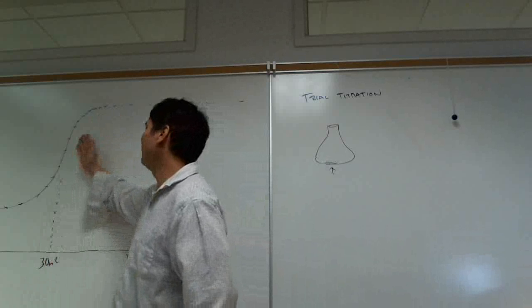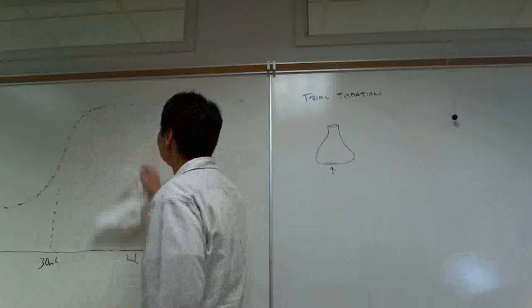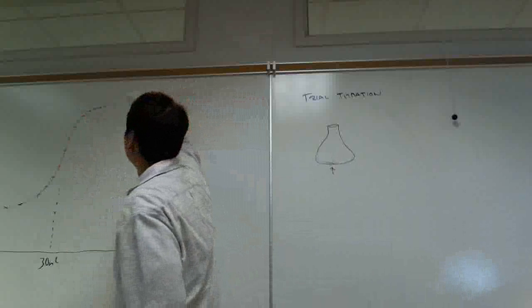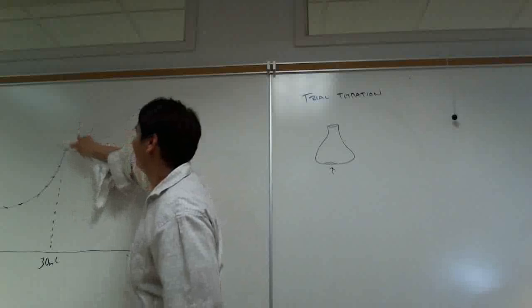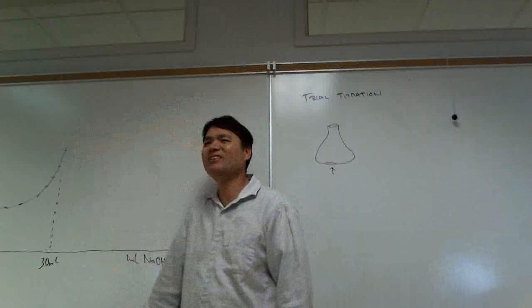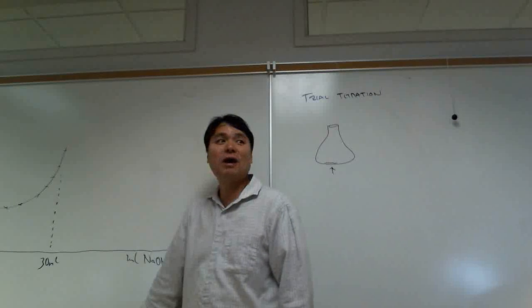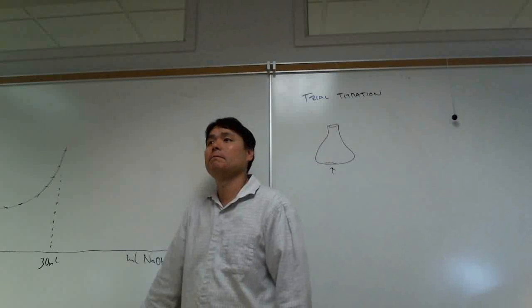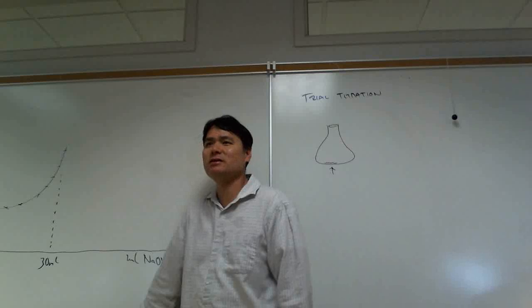I've seen these where the data ends here, because I think I mentioned this yesterday. Their titration curve looks like this after they plot it. What happened was they stopped when it turned pink, and they thought they were all done, so they wrapped everything up, and then they had to repeat it. And that's why I want to use the entire lab period on Tuesday, because every semester this kind of stuff happens. Somebody has to repeat it.